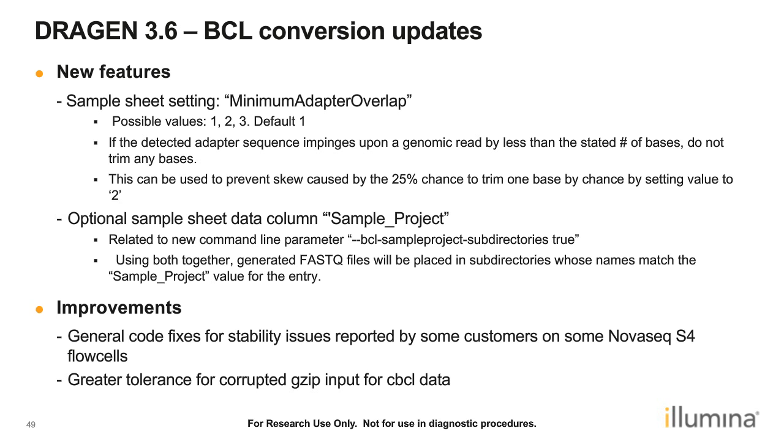And at the same time, there's another update that we have made, where you have a column that you can add to your sample sheet called sample project. What that does is it will let you dump FastQs for a set of samples or a particular sample into a specific project in your BCL folder. So now you can organize your samples based on samples that are related to a specific project versus all the FastQ files being dumped into one single folder, right?